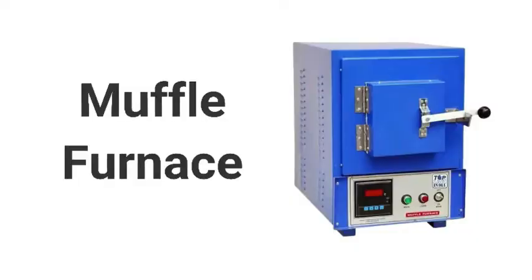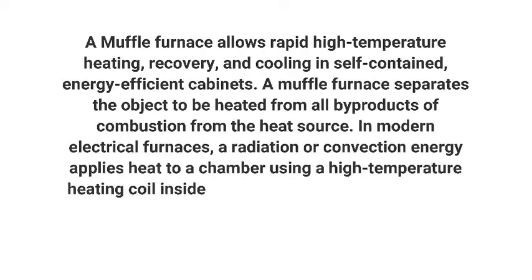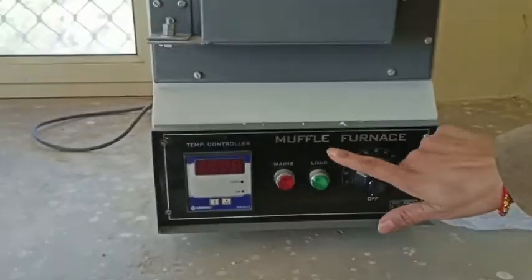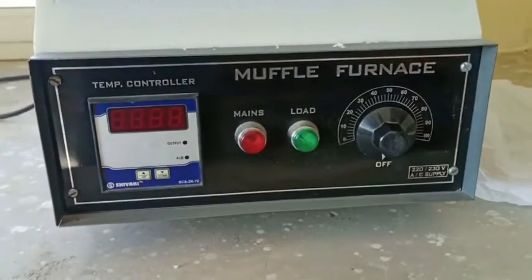Hello everyone, today I am showing you the muffle furnace and how it works. You can pause this and read about the muffle furnace. I'll just show you how it functions and how it looks like.